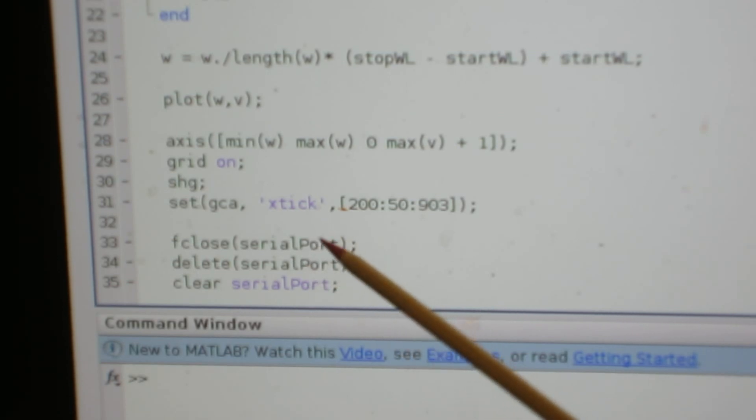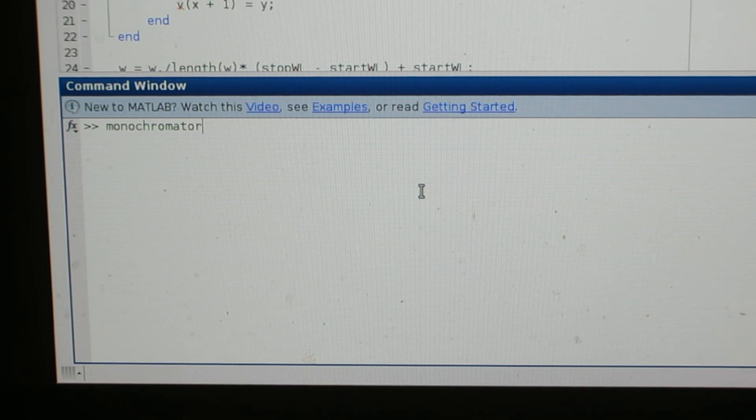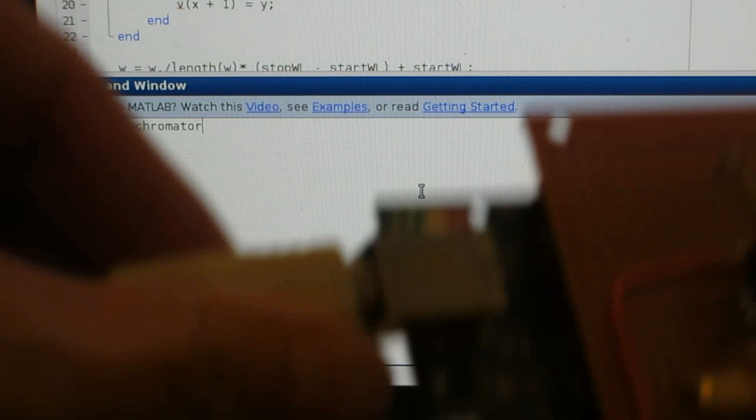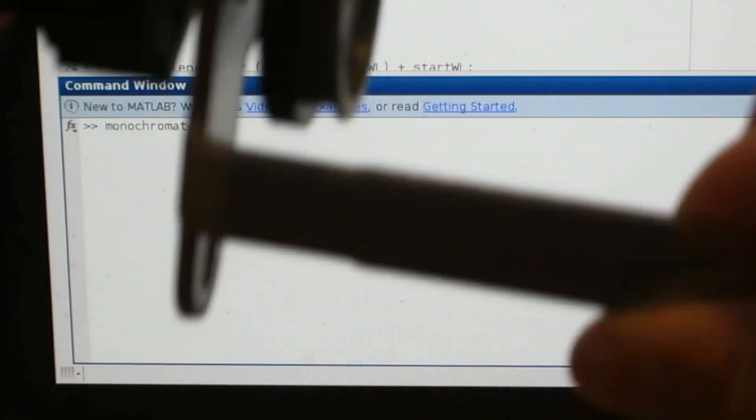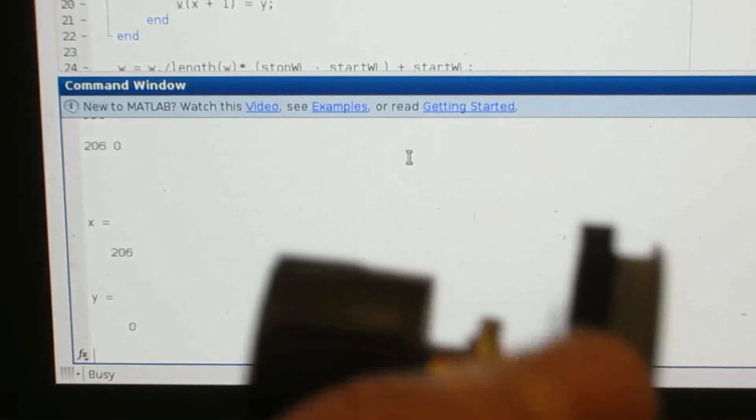Without hooking up my monochromator, let me show you what the output of this program looks like. Now let me start the program. I have my optical encoder hooked up to my Arduino board. If I start turning this wheel, you'll notice that the X number is increasing because I'm turning this wheel here. The Y is zero because we don't have any voltage input.